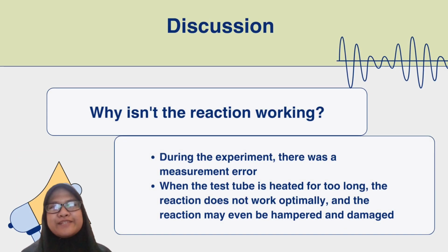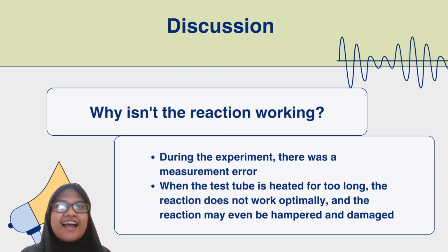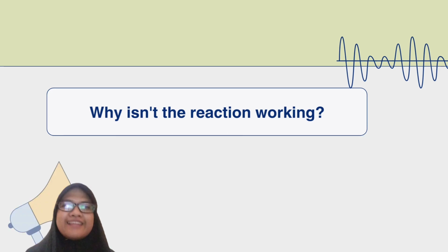Let's move on and discuss why the reaction isn't working. So in the first reason, during the experiment, there was a measurement error. Second, when the test tube is heated for too long, the reaction does not work optimally, and the reaction may even be hampered and damaged.